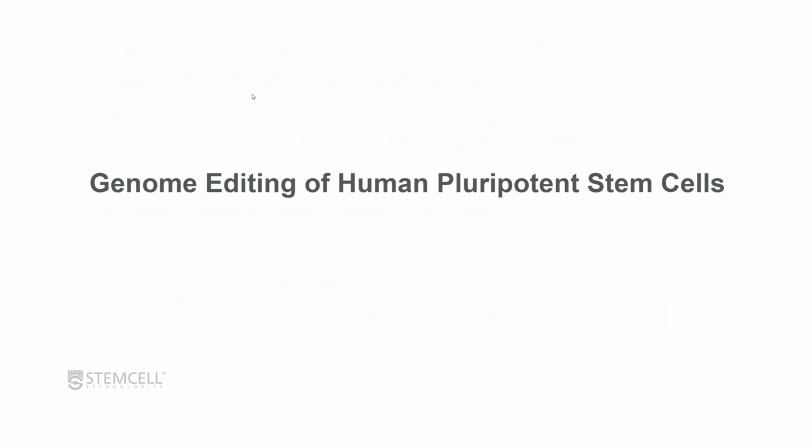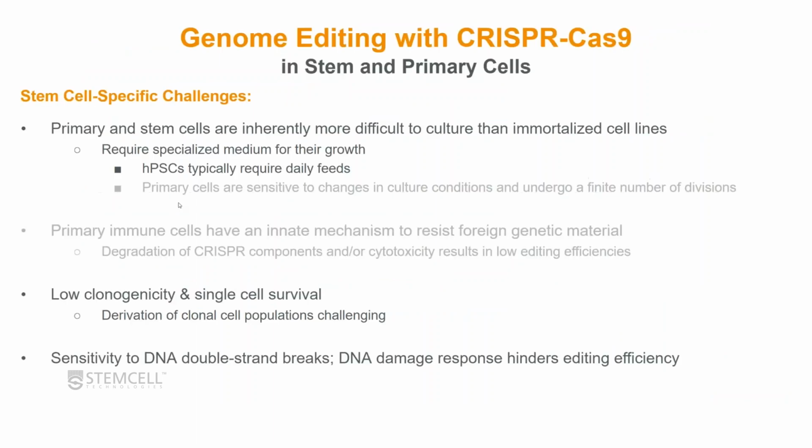But that brings me to the second part of my talk, which is focusing on optimized workflows for genome editing human pluripotent stem cells. So I'm going to go back to this challenges slide and just highlight some of the stem cell specific challenges that are present here. As I mentioned, stem cells are very challenging to culture and maintain, and one of the main reasons for this is because they typically require daily feeds.